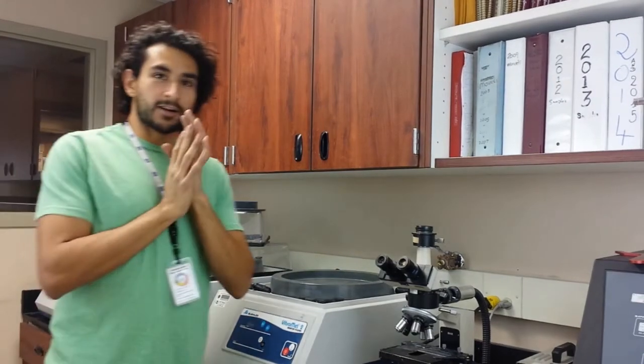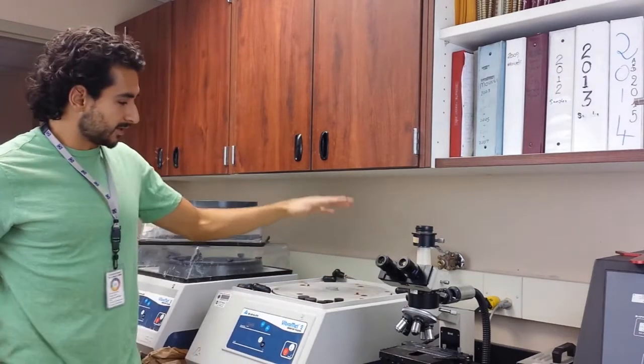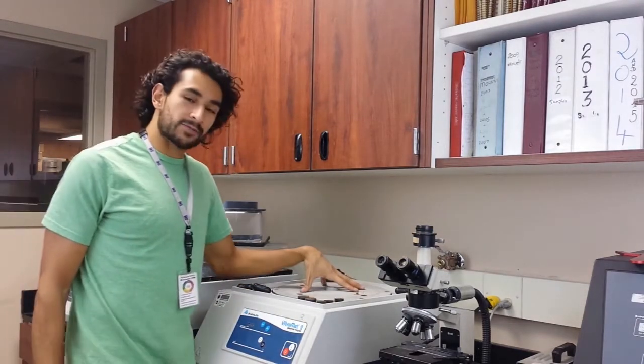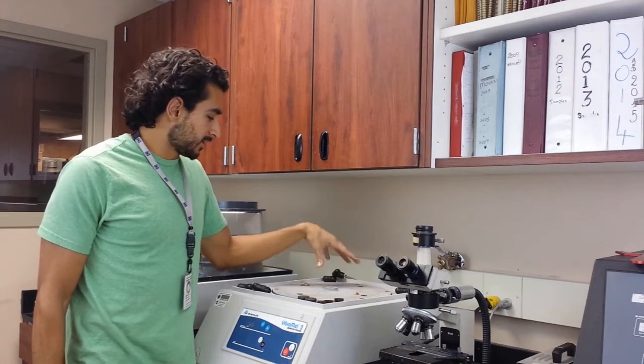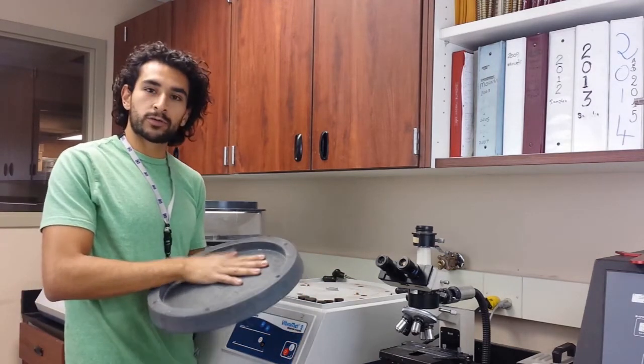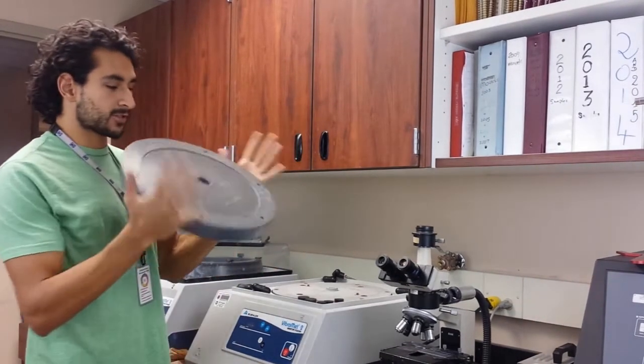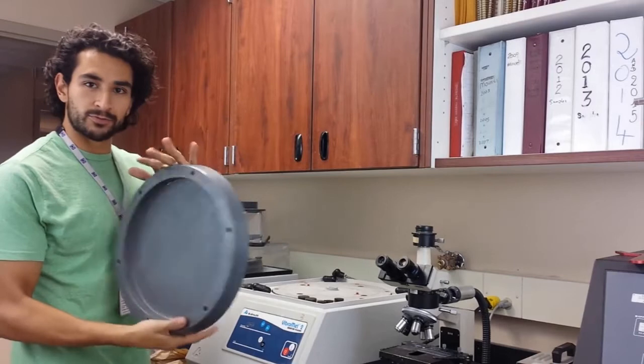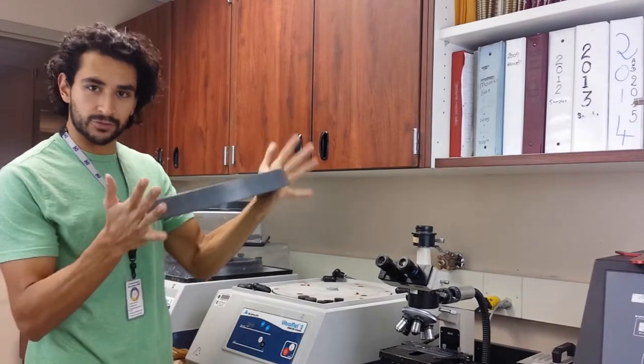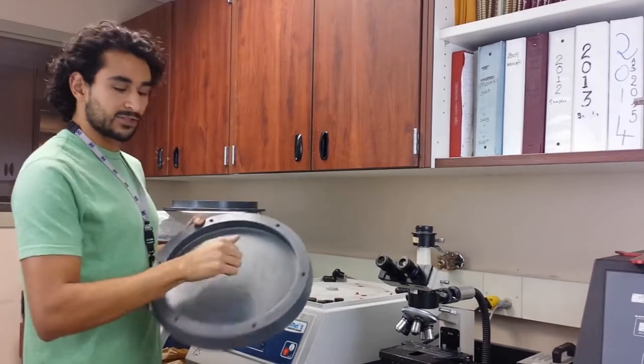Okay, alright, so this is the Vibramet, this right here. This machine vibrates for a long time and as your sample sits inside this bowl, it gets polished. The first thing you need to know is that this bowl is removable and you can wash it. You should wash it every time you use it. And right now it's just a plastic bowl.